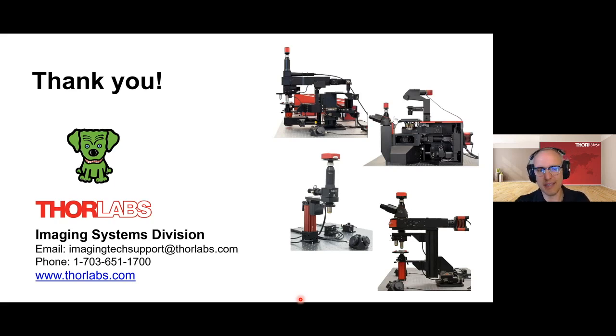The dispersion of the glass then creates group velocity dispersion that separates out those various wavelengths in time and space, which effectively means your pulse gets broadened as it passes through all the glass in the system. A broadened pulse has a lower peak intensity, and therefore decreases the efficiency of your excitation in a multiphoton system. Now, this can be corrected using a pulse correction device that introduces the reverse type of dispersion, although there are limits to what it can achieve.